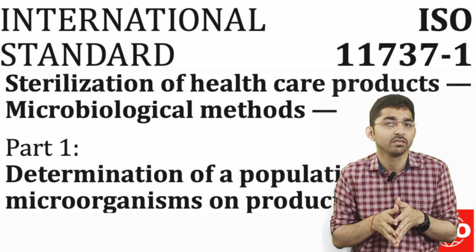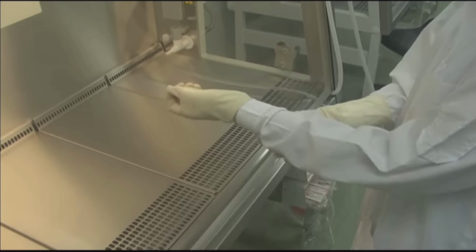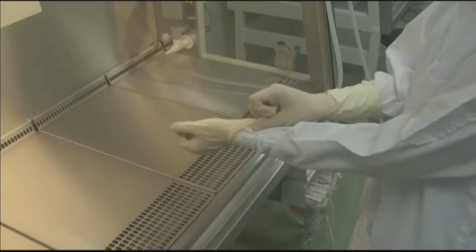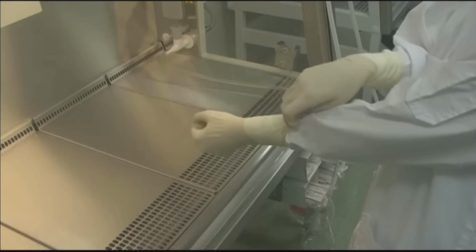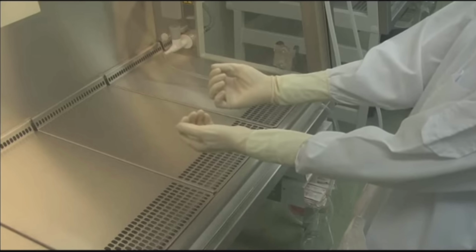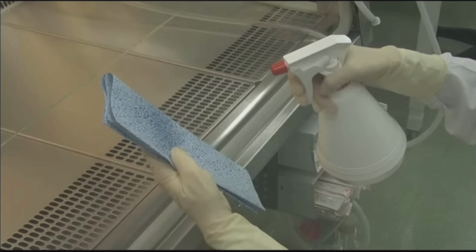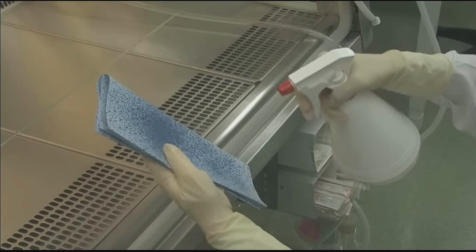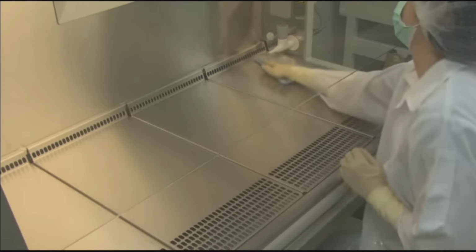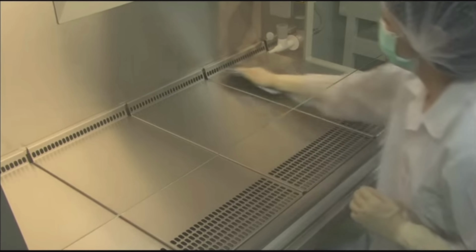So be very confident in that. Before starting the bioburden testing of your biosafety cabinet, the operator must wear proper protective clothing in the form of a lab coat and sterile gloves. Open the designated position of the biosafety cabinet, followed by turning on the blower and the UV light. Now wipe your biosafety cabinet with 70% ethanol in a unidirectional manner, as you can see in the footage.